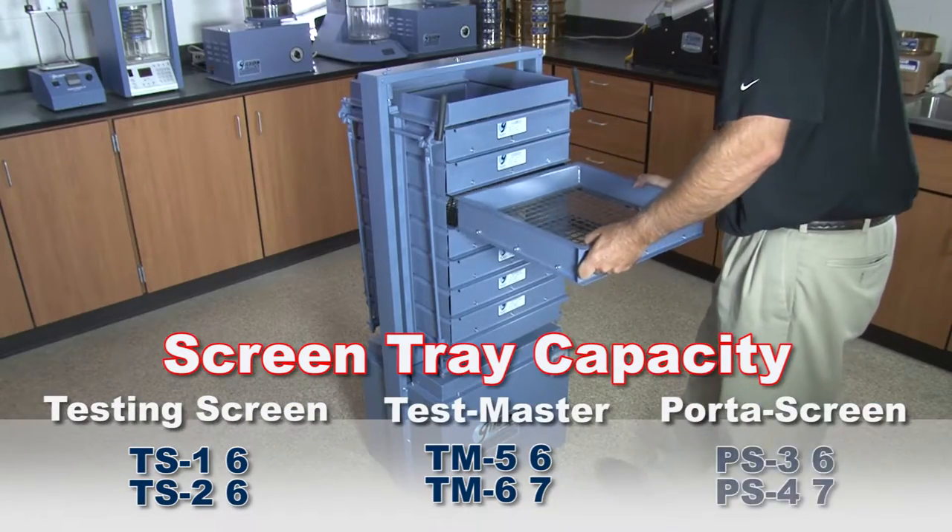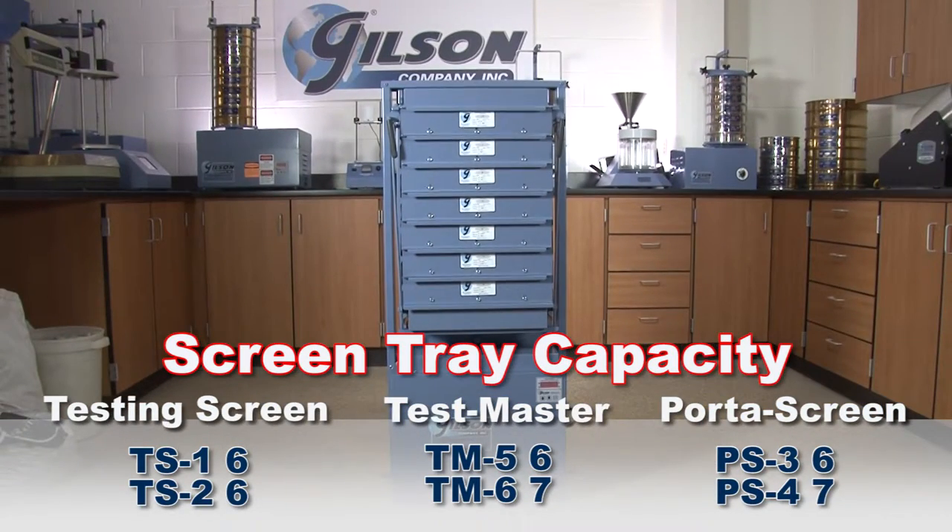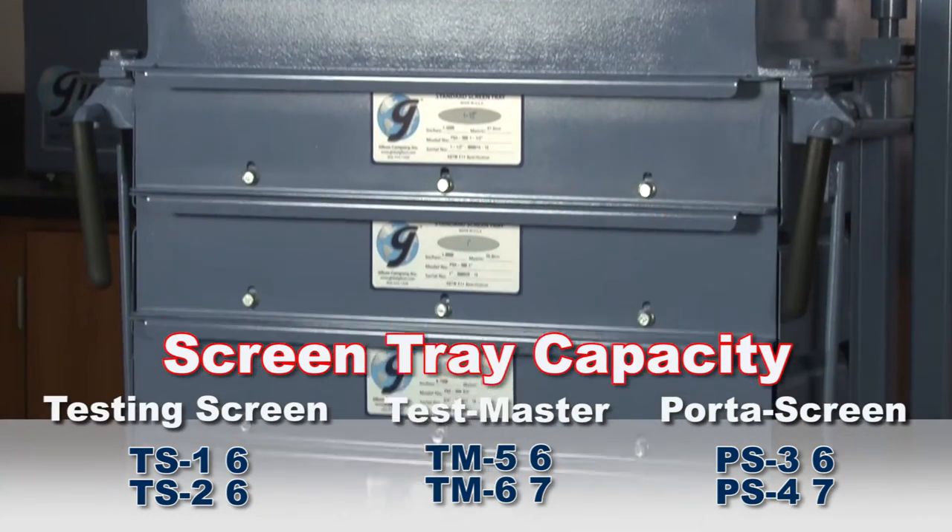The Gilson PS3 Porta screen has a six screen tray capacity while the PS4 Porta screen holds seven screen trays plus a pan.